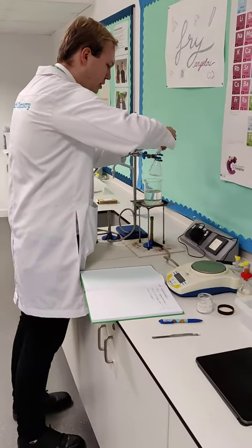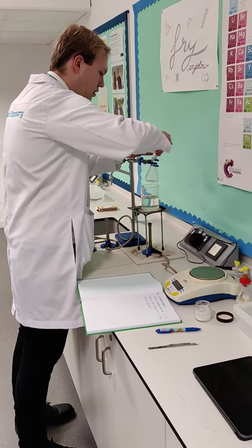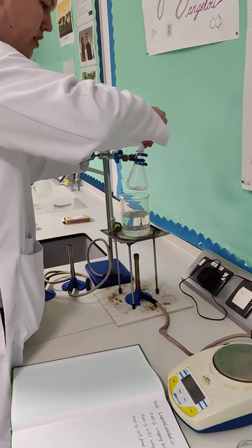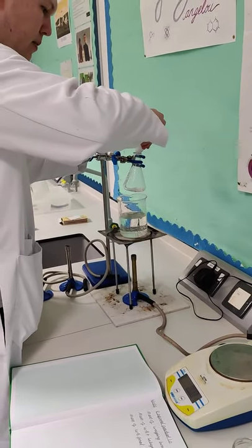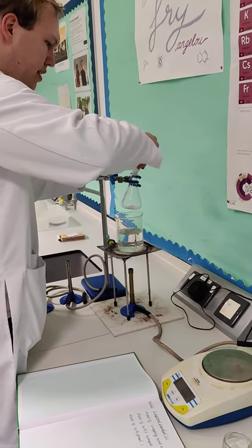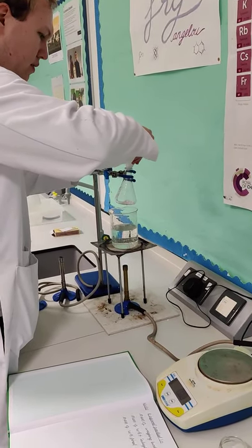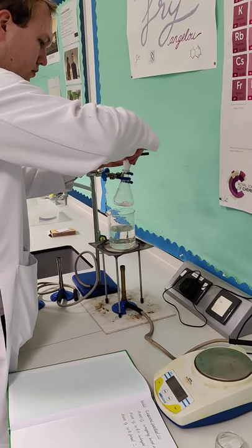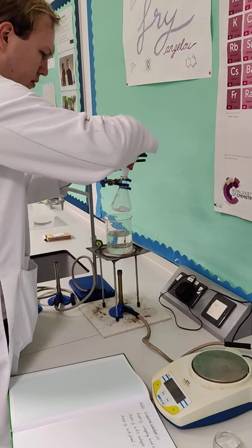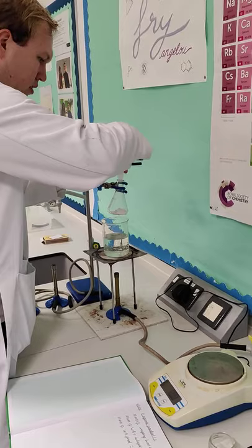Take your time with this because this is going to form your product. You don't want to spill any at this point because that would be wasted. It would have an effect on your yield. Remember, calculating the yield is a key skill — it's actually something that we'll be doing later on with this practical. Once we've made our solid and purified it, we'll then be working out the yield that we got from it.